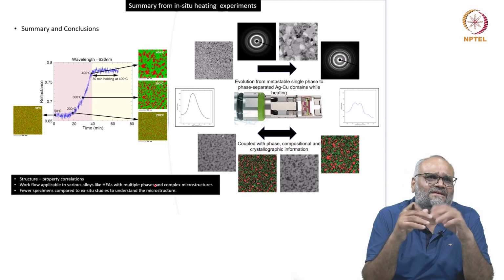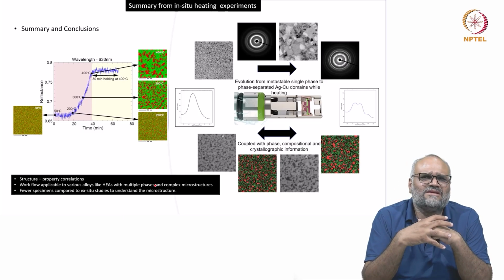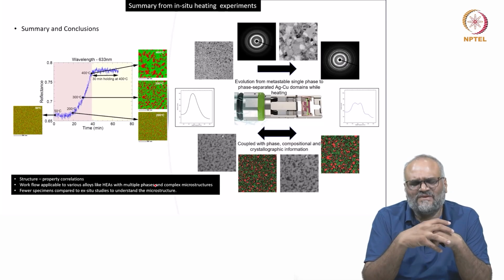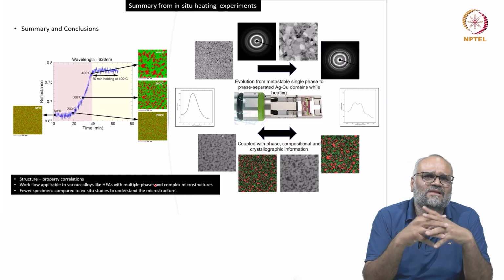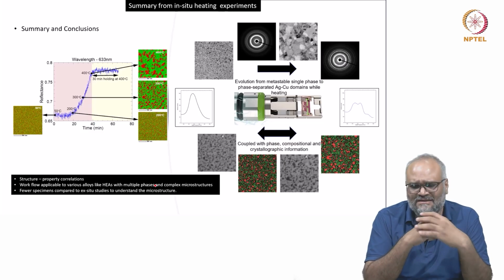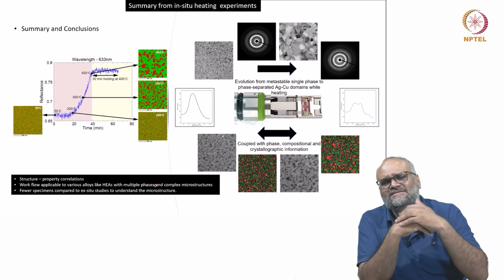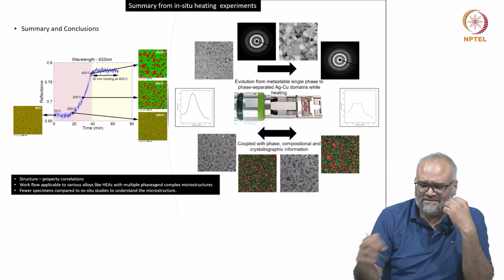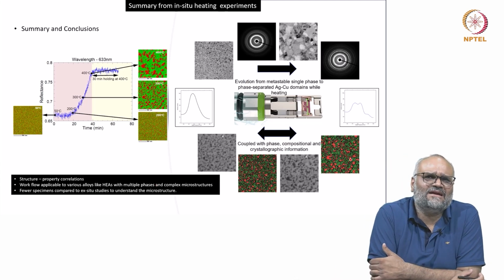On the other hand, in this kind of thin film system, you can actually do very interesting phase separation studies, and these thin films are in particular useful for looking at sensors based on surface plasmon resonance. And with controlling temperature and domain sizes, you can actually restrict the size of these silver domains which show a plasmonic behavior, and these can be used for sensors as well.